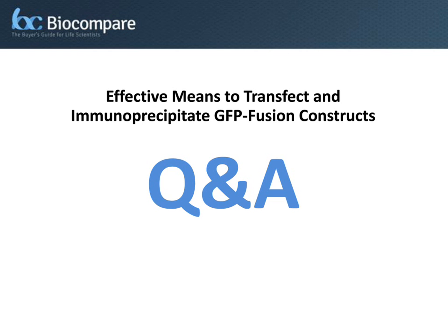At that point most labs will do the electrokinetic transfer in a cuvette electrode, and then you plate after that, and once plated, they'll stick down and most of the cells will survive. However, if you're working with adherent cells and you want to look at something while the cells are still stuck to the surface, the matrix, you can use that adherent cell electrode that I showed earlier.